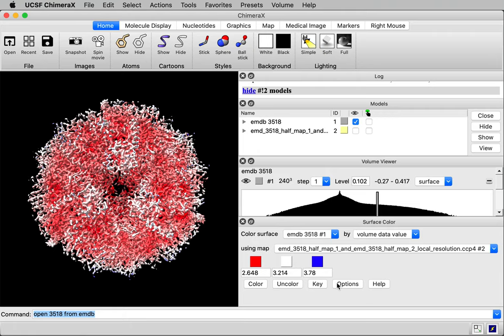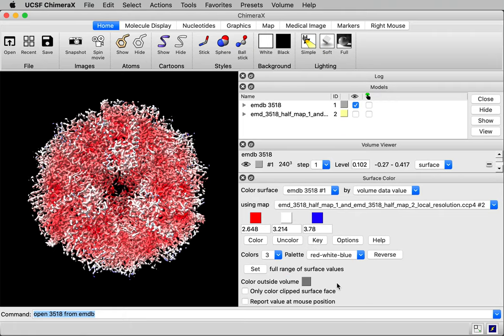So I'm going to click this little options button and under the options there's this reverse button which will reverse the coloring. So blue will be the low resolution and red the high resolution.